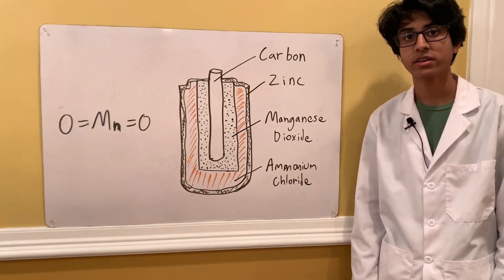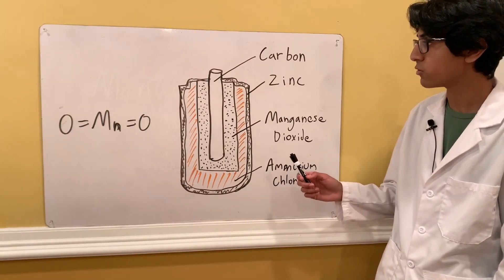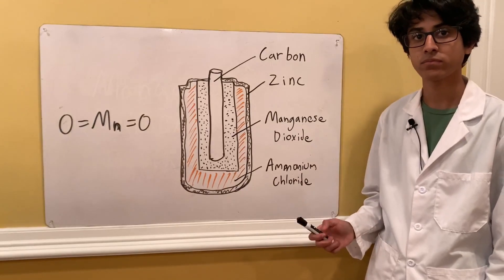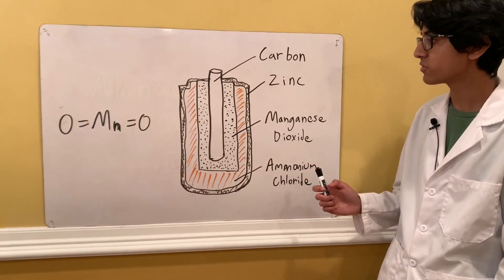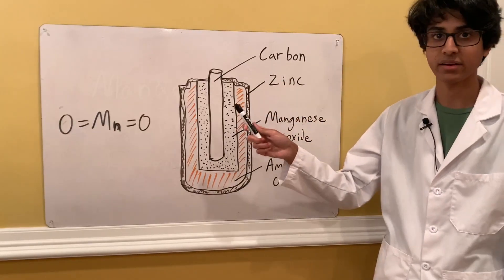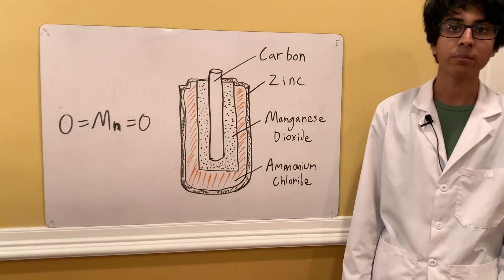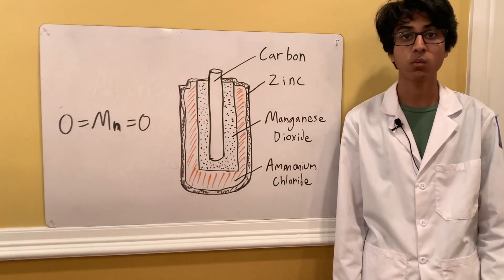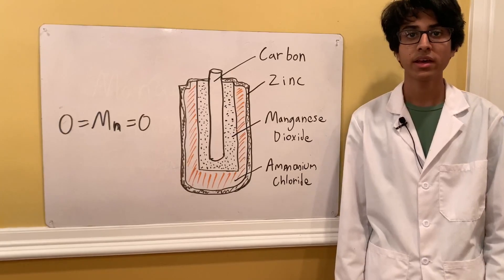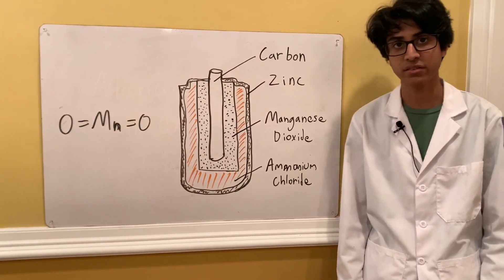The way we're going to extract it is by first using a screwdriver to remove the outer casing, then using pliers to pull out the carbon rod. After that, we can easily scoop out the manganese dioxide. Once we've done that, I'm going to purify it further by washing it in distilled water and filtering it out, and then we should have some pretty pure manganese dioxide.